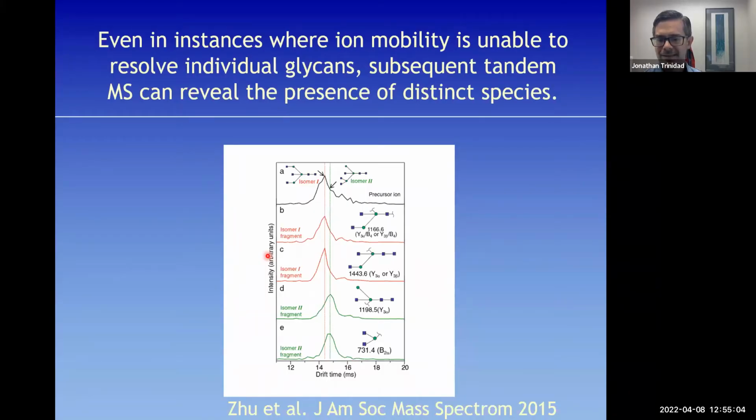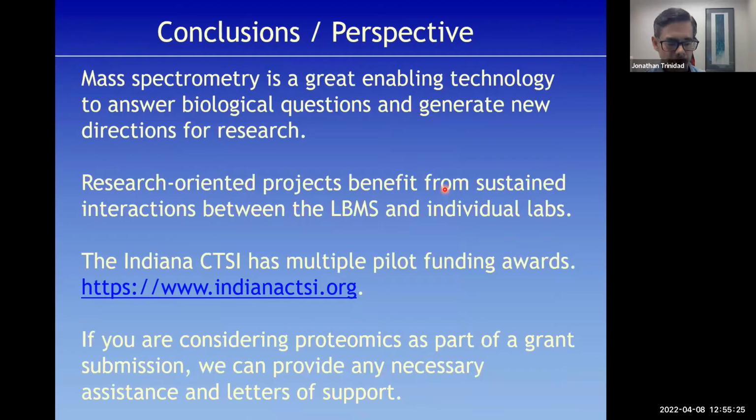This is something very similar, except we're fragmenting ion masses and trying to build back whether we have isomer 1 or isomer 2, or to what extent we have those 2 glycan isomers by looking at unique fragment ions that would occur in one form but not the other.